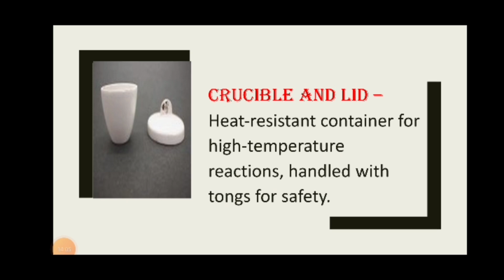Heat-resistant, imagine that term, because the crucible, say for example, meron kang sample na stone, gusto mong maging ash siya, kasi nga ashing siya eh. So, gusto mong mag-pulverize siya, ilagay mo lang yan dyan sa crucible and cover and pour it inside the furnace and set it to 1000 degrees Celsius or more than that. So, in that certain high temperature, imagine kag lava nga pula-pula na siya sa kalayo, very red, ganyan, magiging ganyan si crucible and cover until nga samples inside it will eventually became powderized or ash.